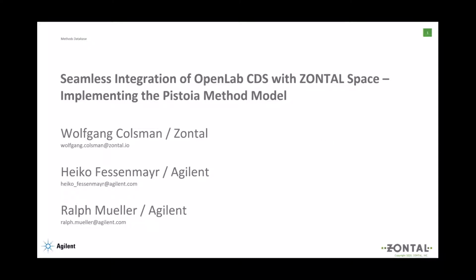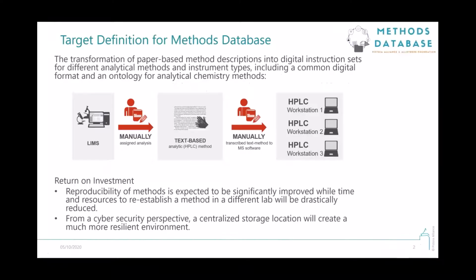So last year we presented the Pistoia methods database project, where we have a set of collaborators, so pharmaceutical companies, Pistoia, Allotrope, and vendors working on a representation of analytical method. And today we're going to present the first implementation of this concept in software.